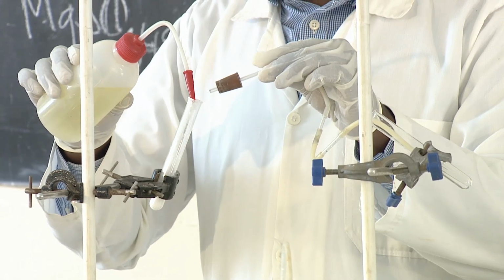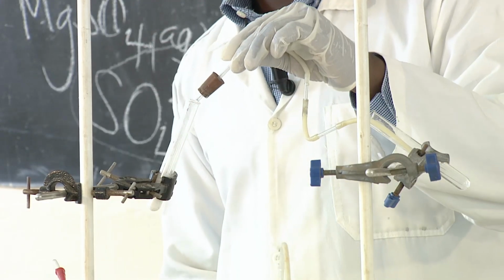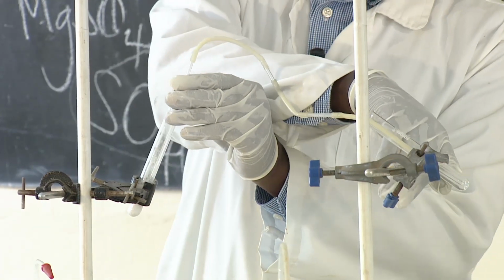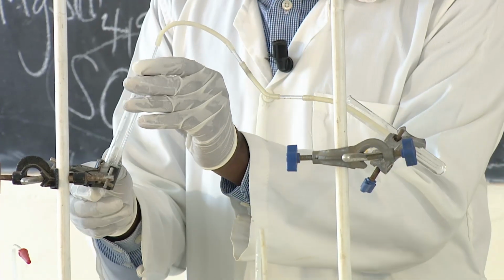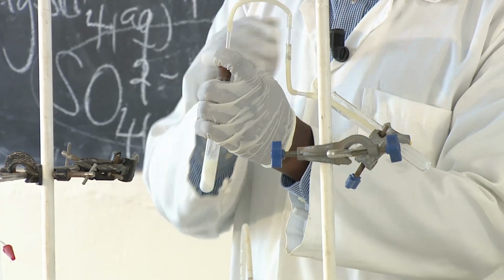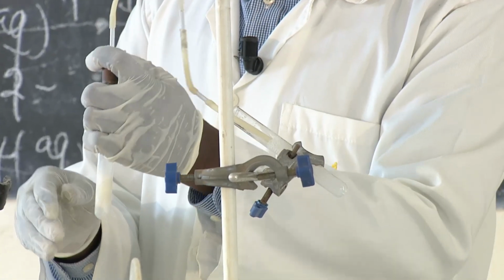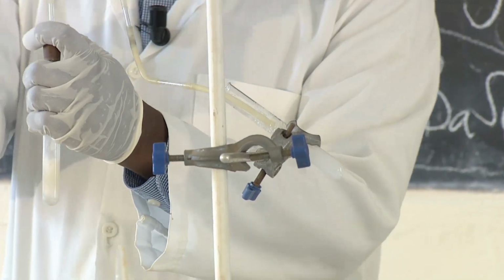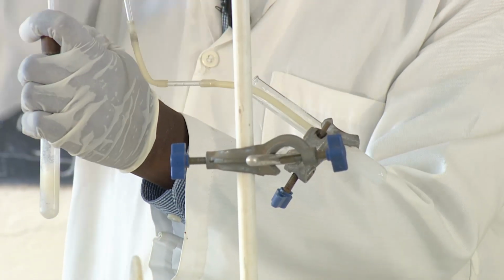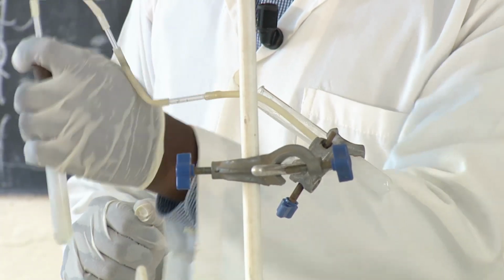So I add a solution of hydrochloric acid. The gas is produced already. If you are very observant, you see the bubbles of the gas. That is carbon dioxide. The solution is turning white, milky somehow. So it turns milky. The gas is coming at a very high rate, so that's why you see the bubbles increasing. The solution turns milky, a milky solution.